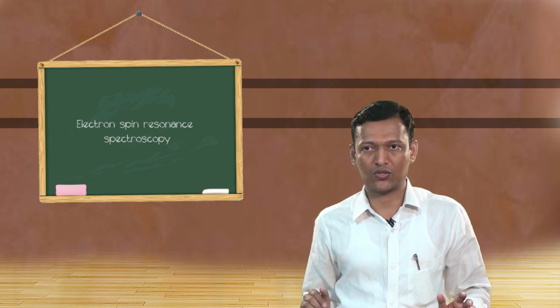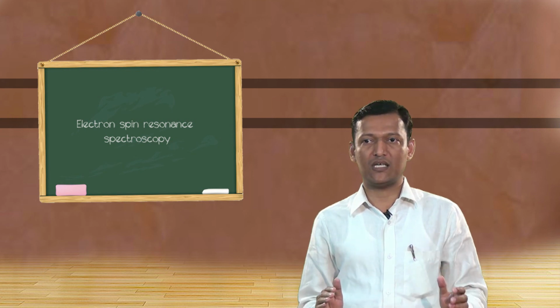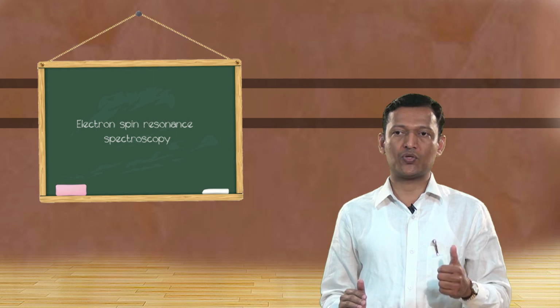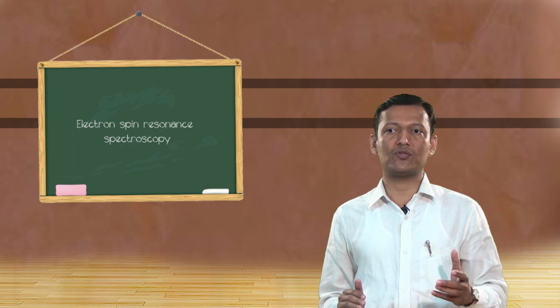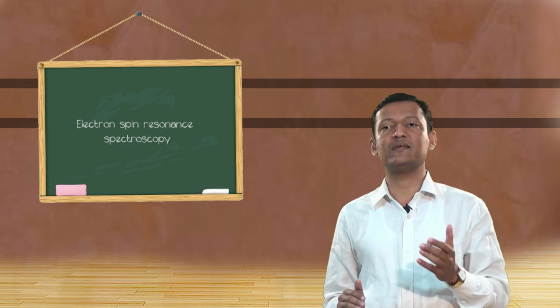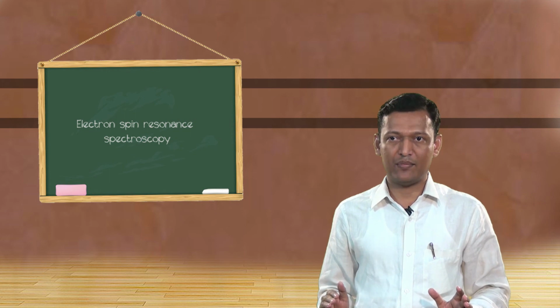So these are the aspects that we have discussed in this lecture. We have studied what ESR spectroscopy is, the introduction to electron spin resonance spectroscopy, the principle behind this spectroscopy, and also the hyperfine coupling constant.